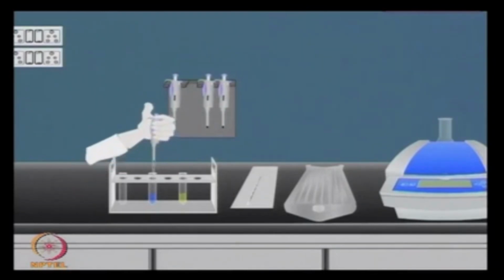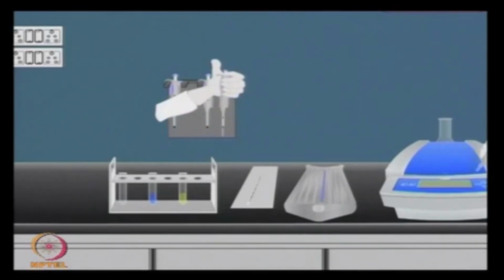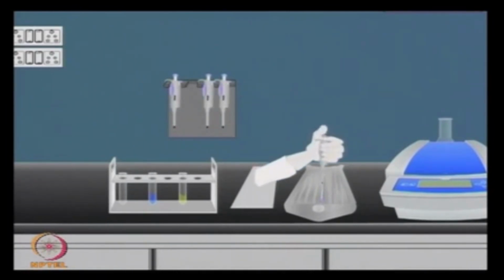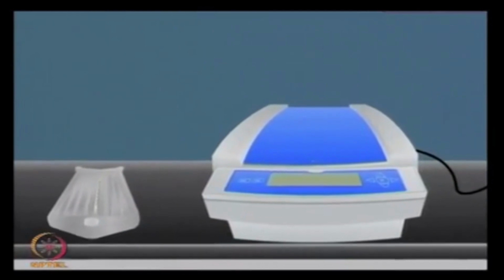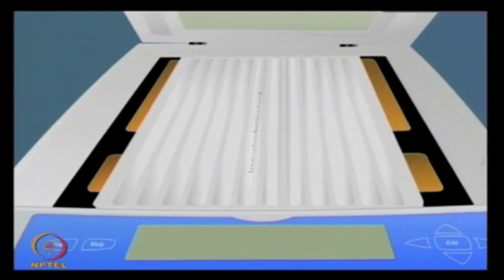Once you have obtained a good amount of proteins, as determined by the protein quantification, now proceed for the rehydration of immobilized pH gradient strips and focusing of these rehydrated strips. So, remove the IPG strip from the cover, place it in the rehydration tray, add the reconstituted protein sample on the strip, pour mineral oil to prevent it from drying, and then move forward for the isoelectric focusing.